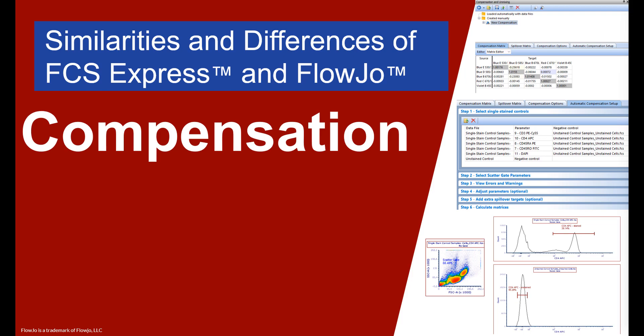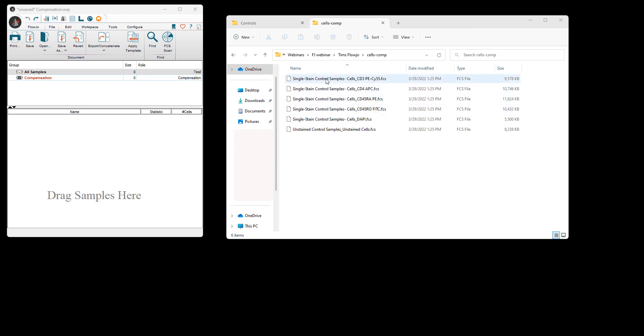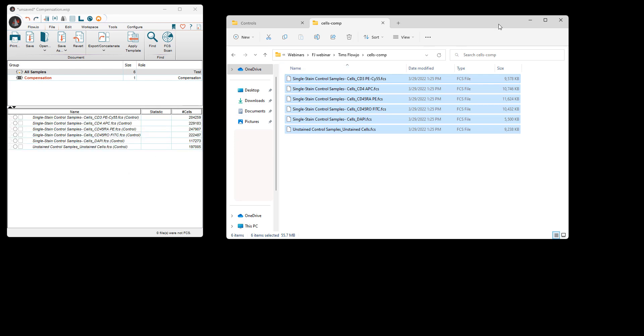Let's first start with loading data. With FlowJo, you start with the workspace and then drag your files into the workspace window. You'll notice that in the group area there is a category called Compensation. This category only has one file — a universal control file. Since not all of the controls are in the compensation group, we will drag the additional single stained controls from the All Sample group to the Compensation group. Once we have all of our controls in the compensation group, we will select the Compensation Wizard icon to open the wizard.